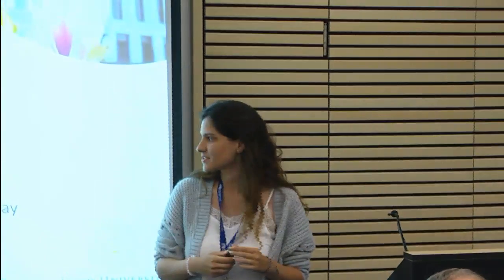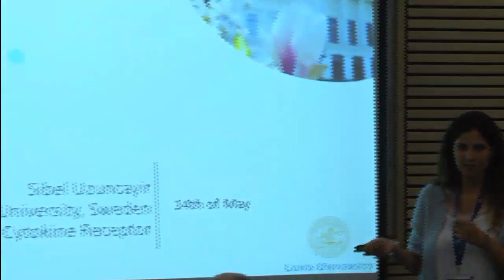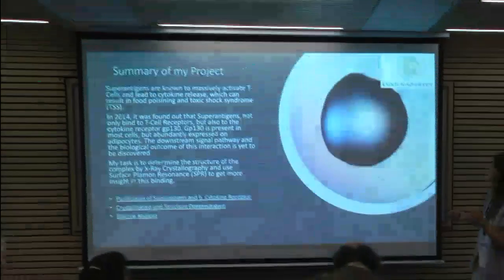So, hey, I'm Sibel. I studied biochemistry in Germany, and then I moved to Sweden to study biomedicine, but it's medical structural biology. So I work with superantigens, and it was found out that they bind to a cytokine receptor, which was called GP130. And I investigate the binding with surface plasmon resonance and try to crystallize the complex.